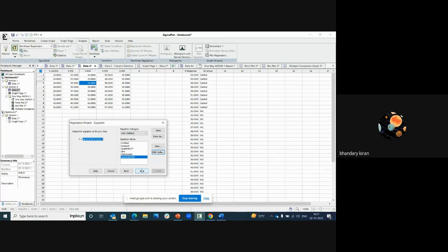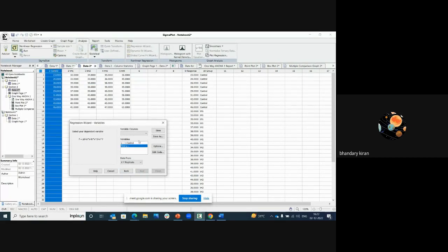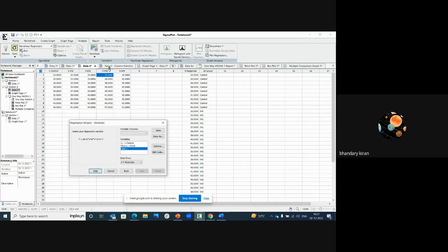Another highlight in this equation fitting is that the software is going to generate the report of the fitting also. So I'm going to show you now how the report is generated for every fitting. Next, I just fit the new equation only. I'm selecting the control group as X and the Y as this one, the first Y as treatment 3 and the last Y as this.